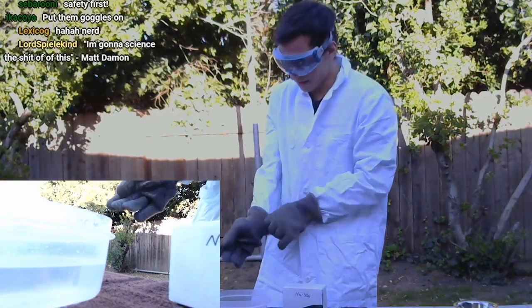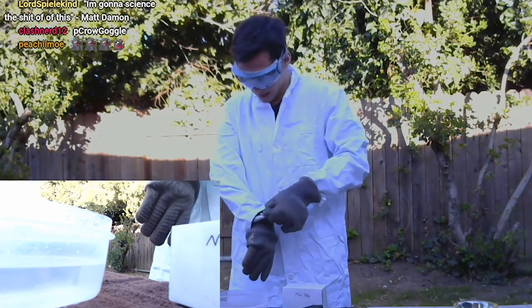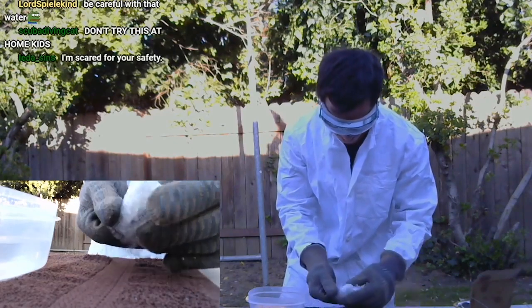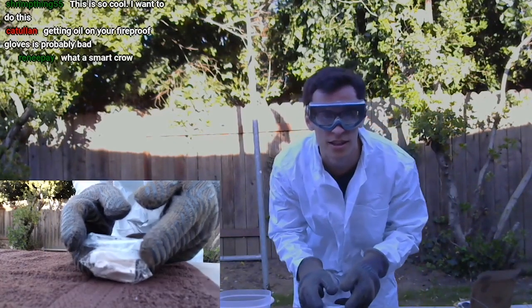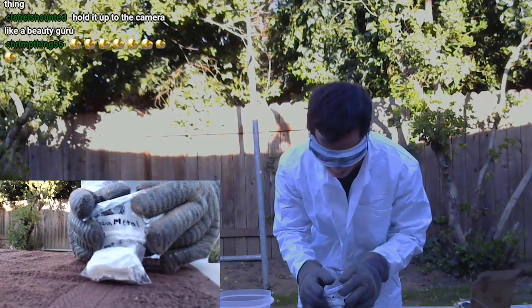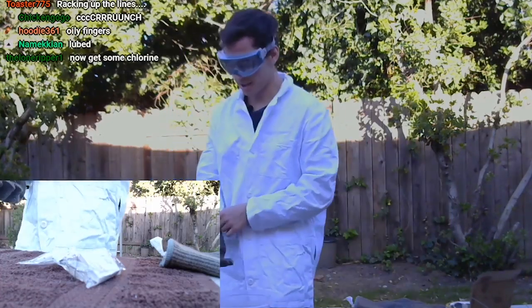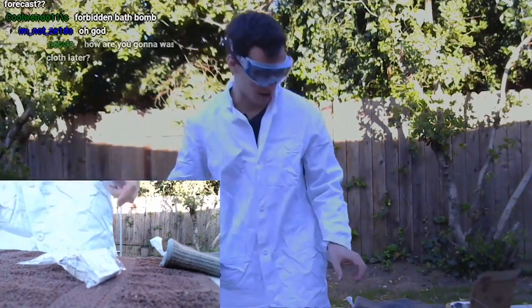Wear your helmet, kids. So right here is pure sodium. It's very oily — I don't know if you can see it right there. It's covered in oil. They really don't want sodium oxides for obvious reasons — there's water and air.